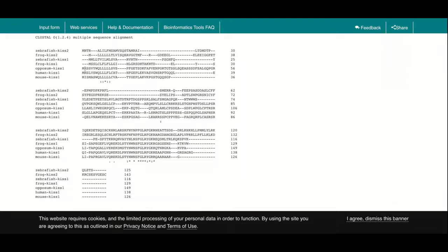On the muscle, this methionine is over here, so there was one more agreement over here. And in here on the muscle, there was something that agreed also. So in this case, one is not terribly better than the other. And maybe down here. Let's see. Maybe there isn't a clear winner in this case.